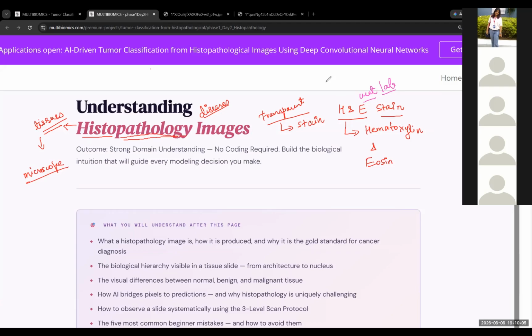See, this is basic, you learn it in microbiology or biotechnology, in the first or second year in the microbiology lab. As a biologist, you should learn this, and you do. That's in the syllabus in almost all colleges. So this is differential staining where we are using more than one stain.